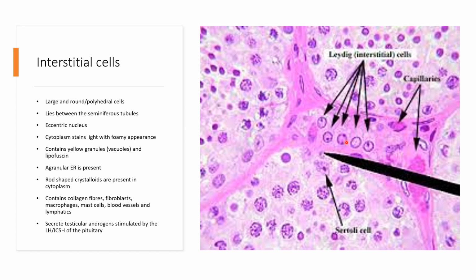Okay, so you can see the cells themselves. They are round, large, and polyhedral in shape. Their nuclei are eccentric, which means they are towards the equator. Let me point at this particular one. You can see the nucleus, that mauve-colored dot. You can see how eccentric it is, almost towards the end point of that line.